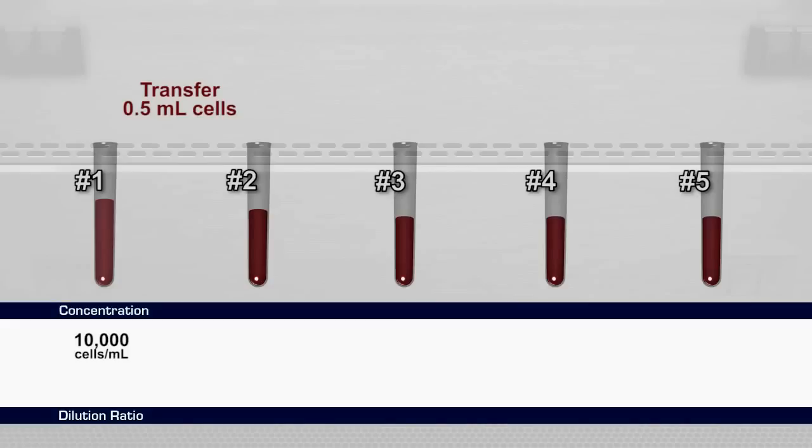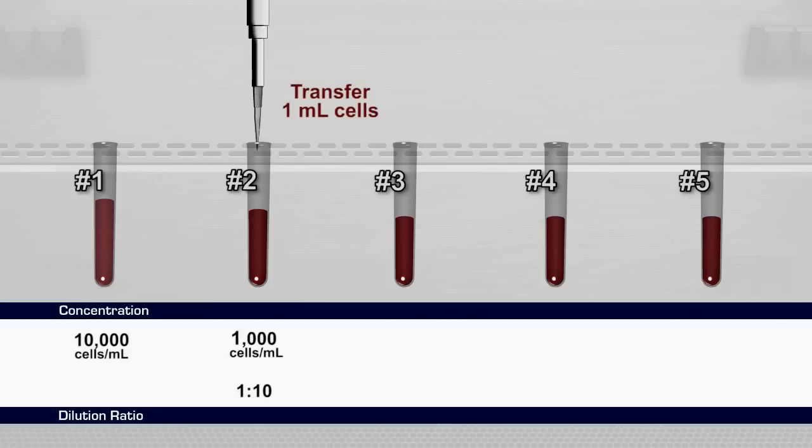Use a micropipet to remove 0.5 milliliters of the cell suspension from tube number 1 and transfer it to tube number 2 for a 1 to 10 dilution. The cell concentration of tube number 2 is now 1,000 cells per milliliter. Let's dilute the concentration again. Transfer 1 milliliter from tube number 2 to tube number 3 for a 1 to 5 dilution and a concentration of 200 cells per milliliter.